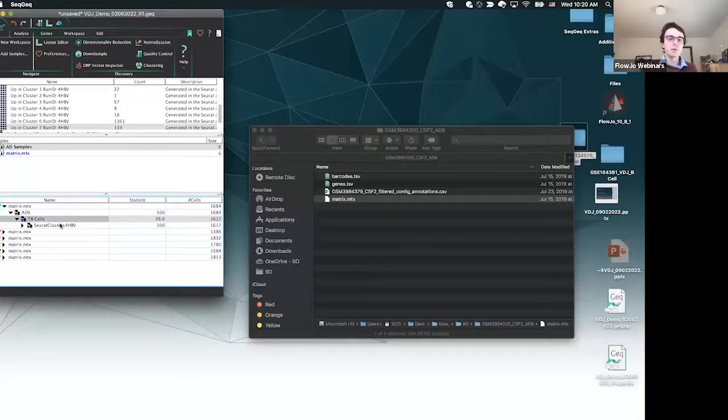Again, if you're new to SeqGeq and you maybe want more information on how to do normalization, how to draw these gates and get down to a population of interest, I'd encourage you to go look at our Intro to SeqGeq webinars or our videos on our website that have all the more fundamental steps of SeqGeq, because I'm going to launch off here directly into the VDJ analysis bit.